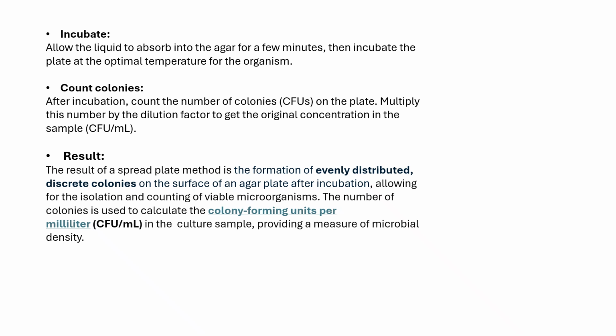Then spread the sample gently and evenly across the entire surface of the nutrient agar plate. Then incubate the plate at the optimal temperature for the microorganisms. Then count the colonies after incubation. Count the colonies from the plate. Multiply this number by the dilution factor to get the original concentration of the sample.